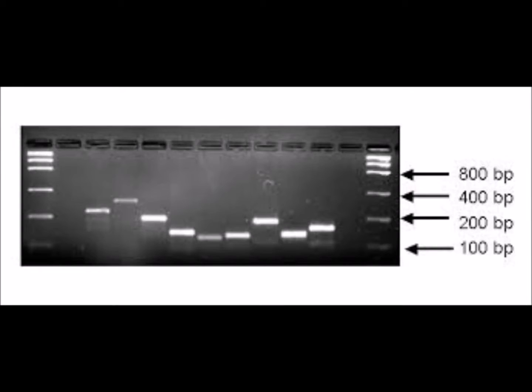Agarose gel electrophoresis is a way to quickly estimate DNA concentration. A sample of the isolated DNA is loaded into a well of the agarose gel and then exposed to an electric field. Since small DNA fragments migrate faster, the DNA is separated by size.